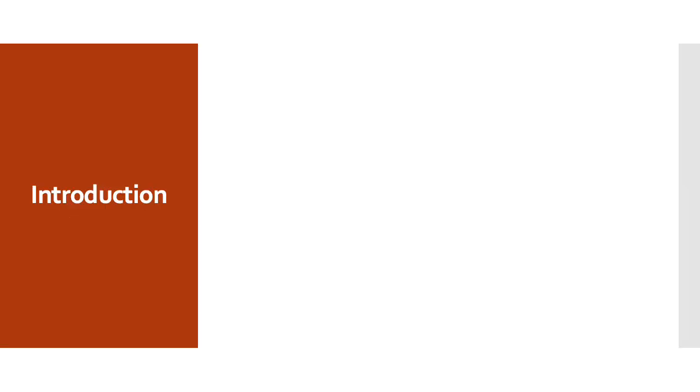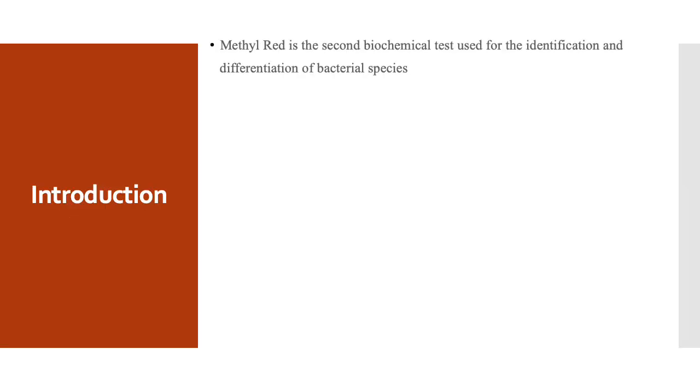Friends, Methyl Red Test is the second biochemical test in the consortium of IMViC Tests and is used for the identification and differentiation of bacterial species.